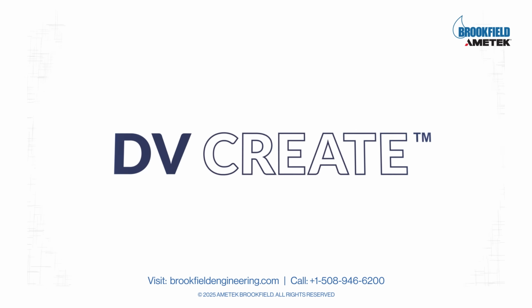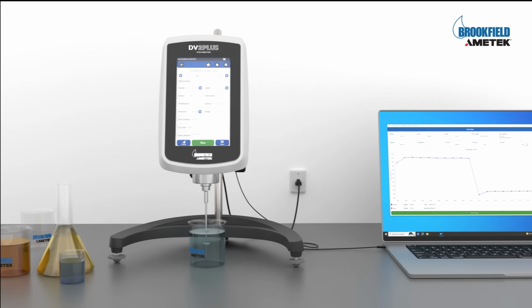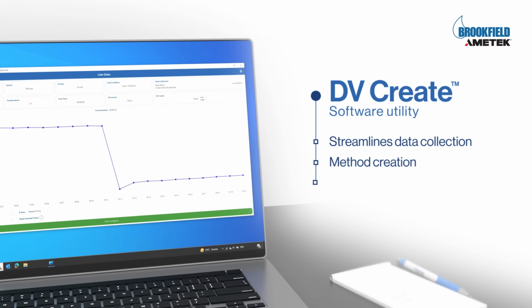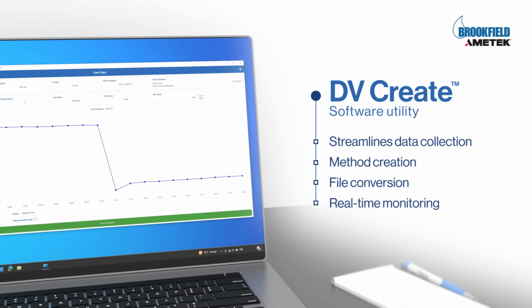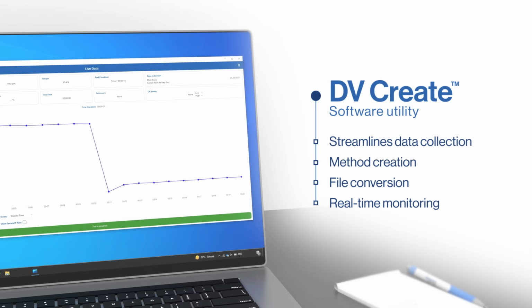DV is a lightweight software utility designed for the DV2Plus Viscometer. It streamlines data collection, method creation, file conversion, and real-time monitoring, ideal for QC labs, R&D teams, and production environments.